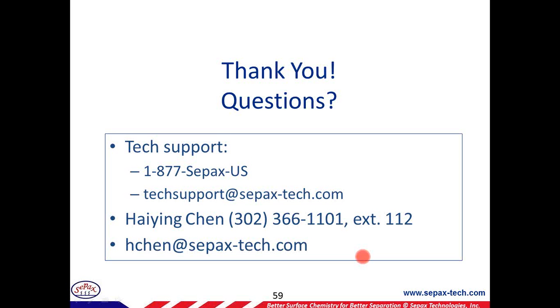All right, one more question. What is the lifetime of the Sepax cation exchange column? For our columns, we have tested with the QC methods up to 250 runs. A lot of times we get customer feedback that they can run 500, 800 runs. But I have to emphasize, it all depends on how you take care of your column, whether you have a guard column, a pre-column filter, and storage conditions. You have to make sure the whole process is smooth, and also the cleaning of the column. These are very important factors for a long column lifetime.